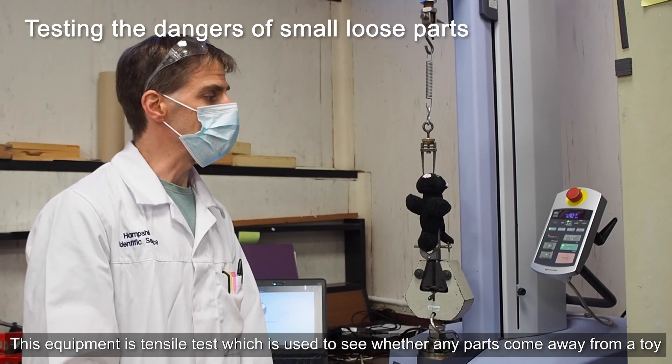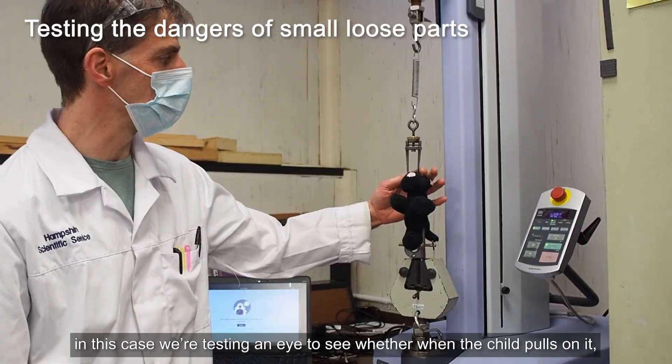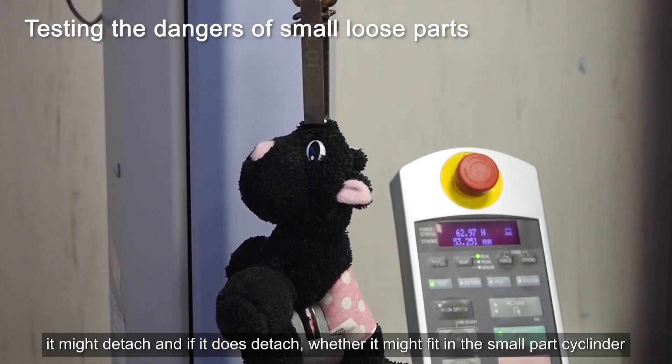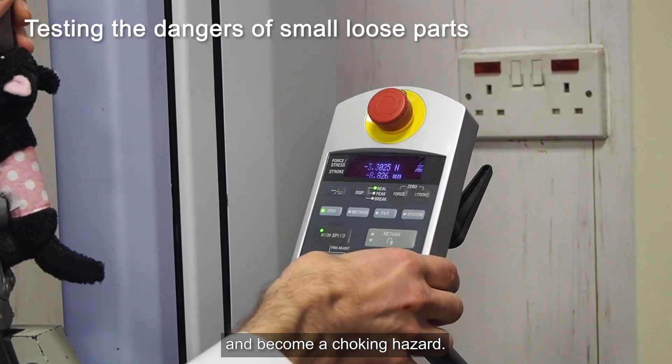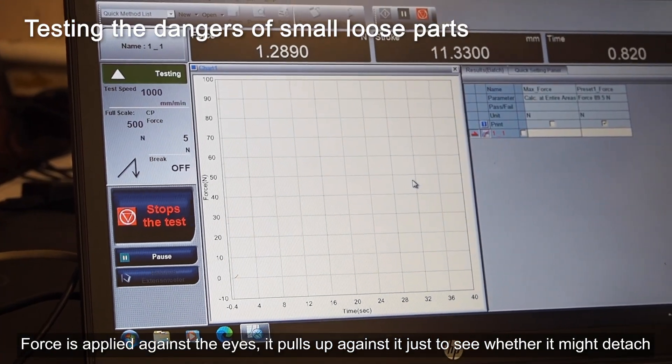This equipment is a tensile tester, which is used to test whether any parts come away from the toy. In this case we're testing an eye to see whether when a child pulls on it, it might detach, and if it does detach, whether it might fit in the small part cylinder and become a choking hazard. Force is applied against the eye just to see whether it might detach.